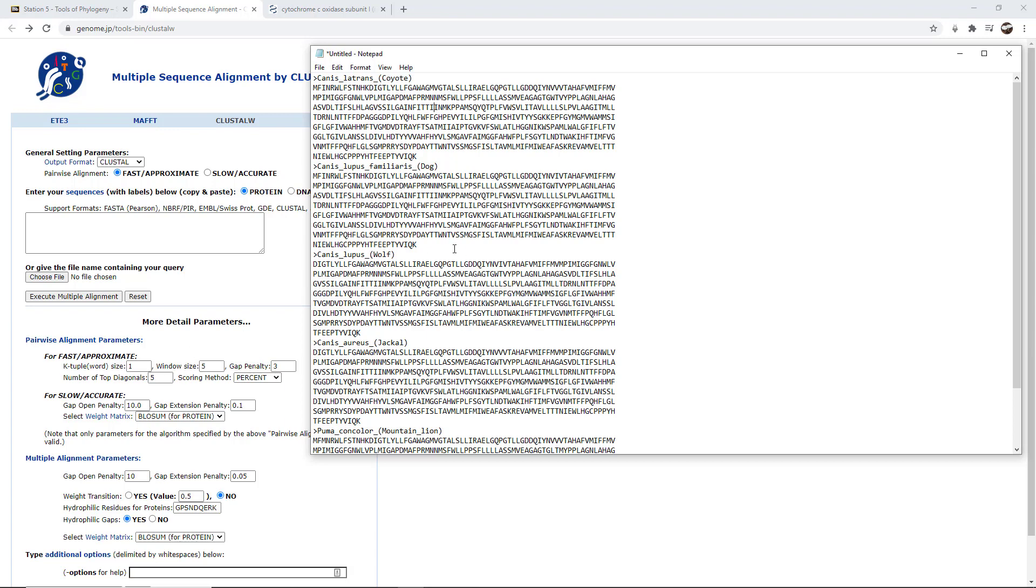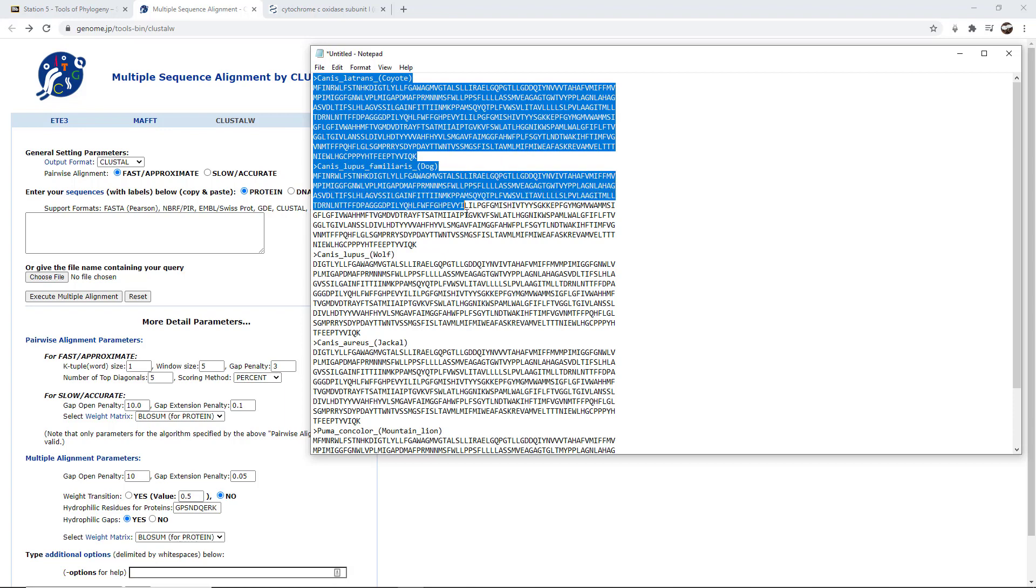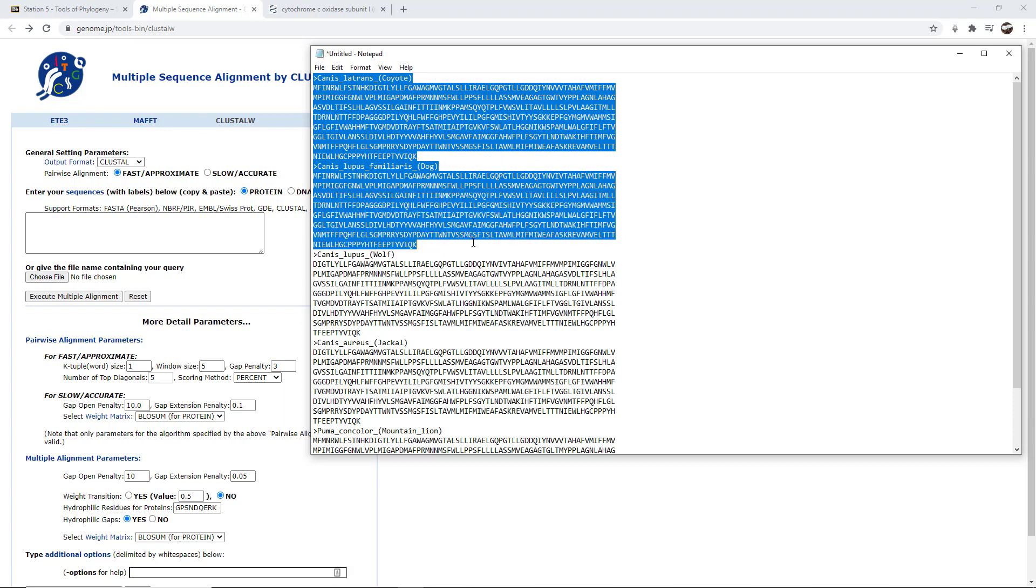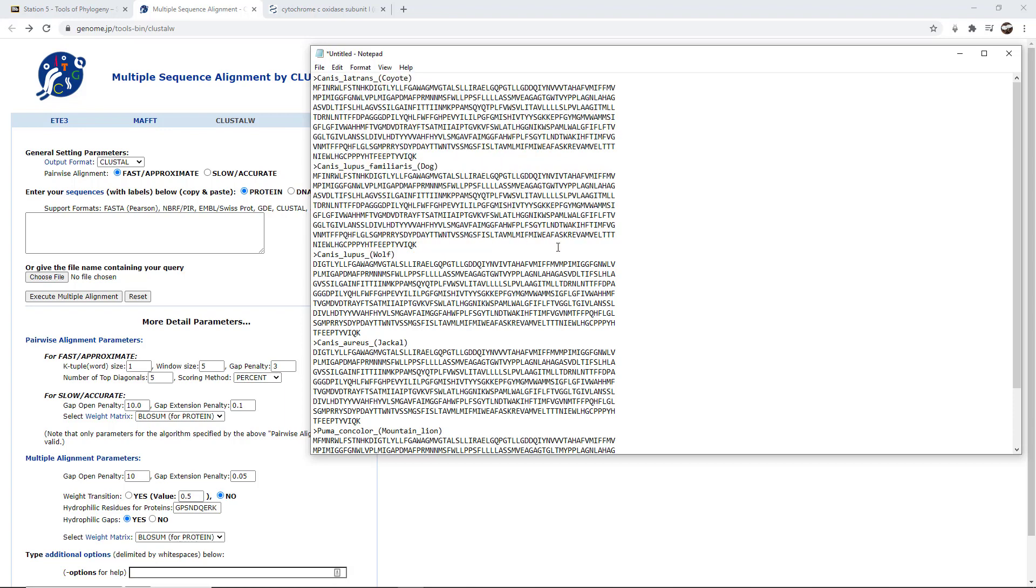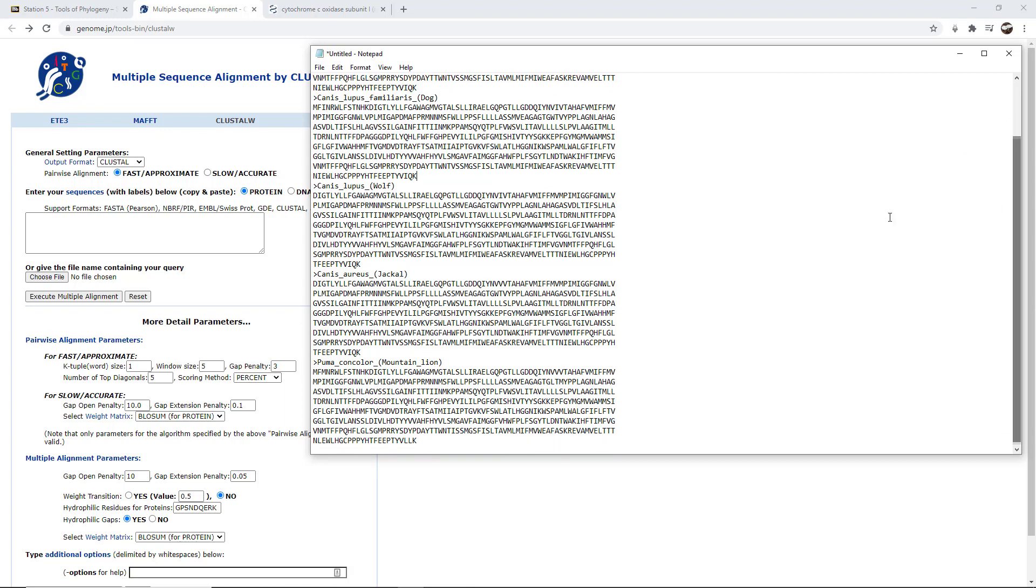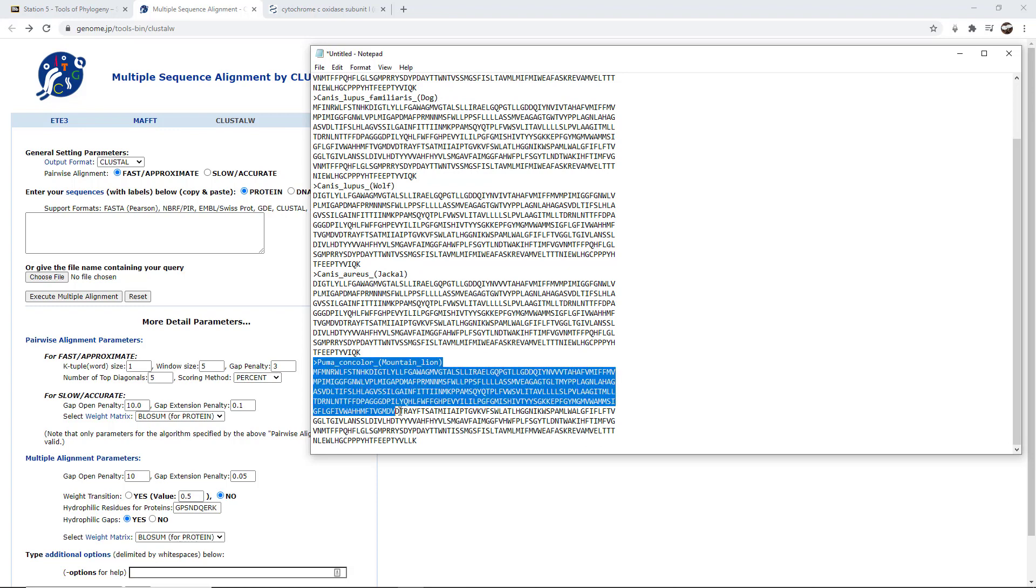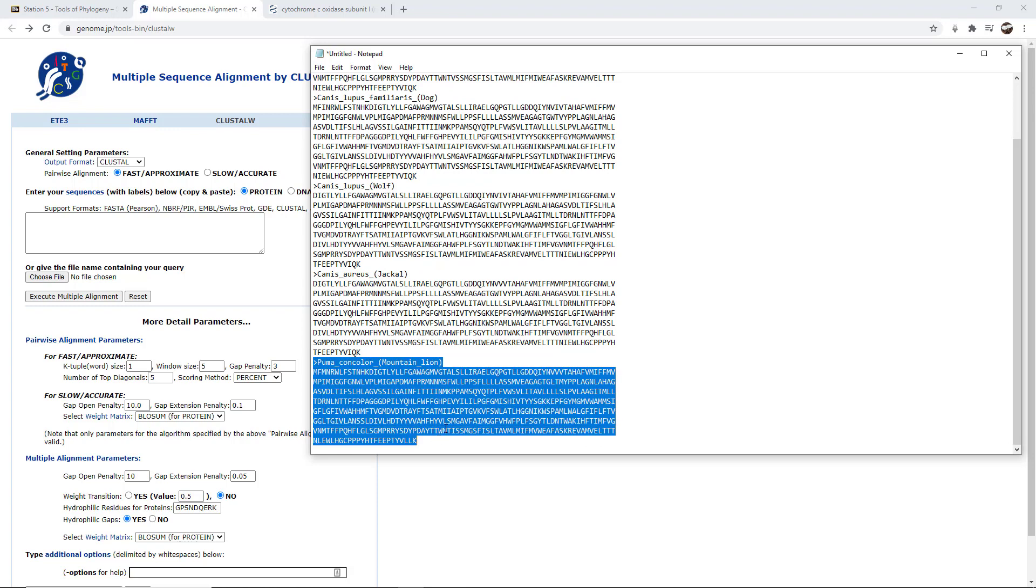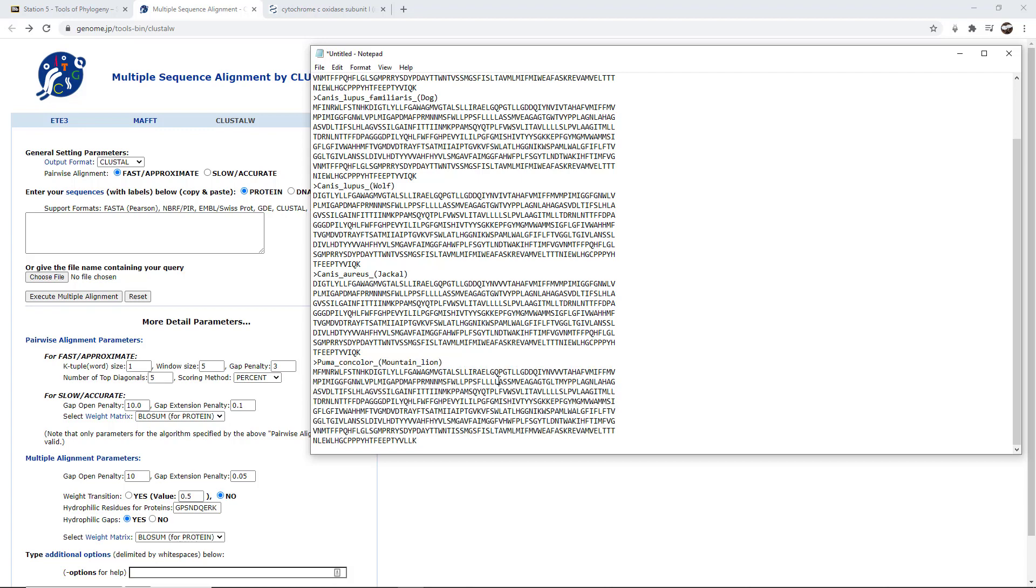So what I did last time is I showed you how to download the coyote and the dog sequences. I went ahead and added a sequence of a wolf, a jackal, and a mountain lion. Now the mountain lion is going to serve as our outgroup in this case, and we'll discuss why that's the case when we get to the analysis. This being a cat is considered to be a distant relative, but still closely related.